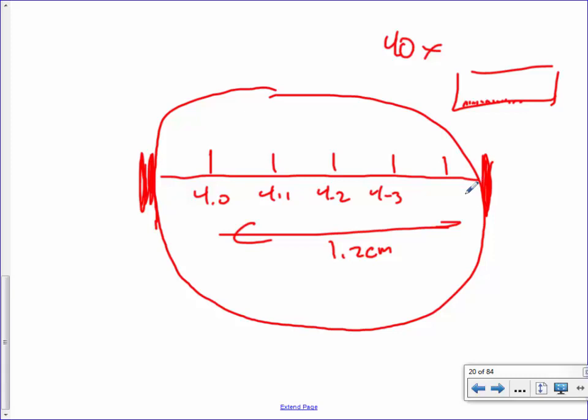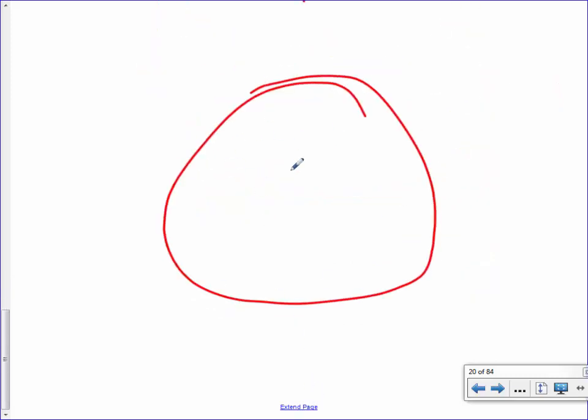Does that make sense? What happens then is, let's say we flip to the next lens and zoom in more. If you used to have a picture that looked like this, and you zoom in even more, now you're looking at just this tiny little section right there, so much more zoom that you won't really have a frame of reference anymore. So we have to figure out how big that is. The problem is at a certain point we can't put the ruler underneath the microscope anymore because it's too zoomed in to even help. Does that make sense?